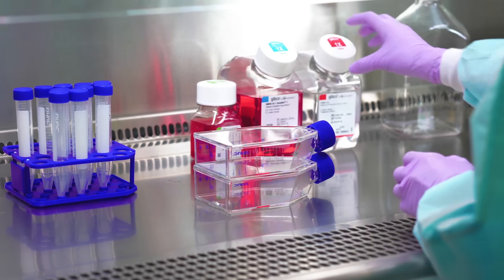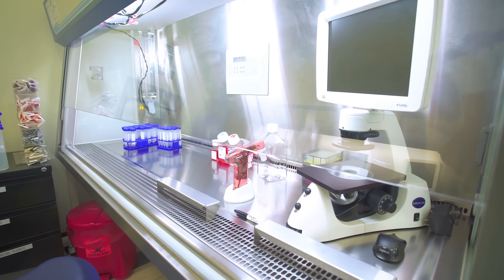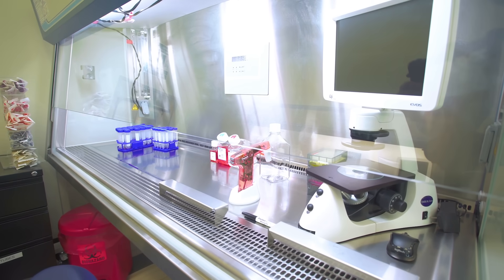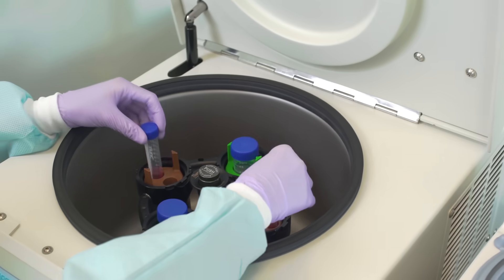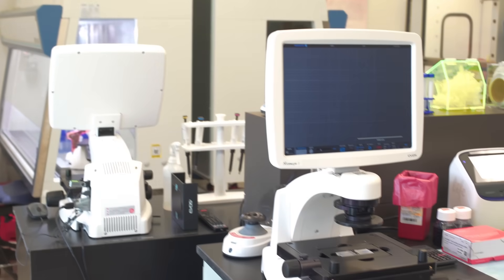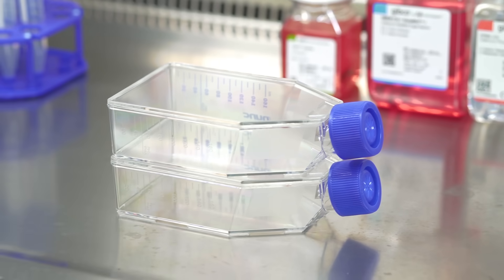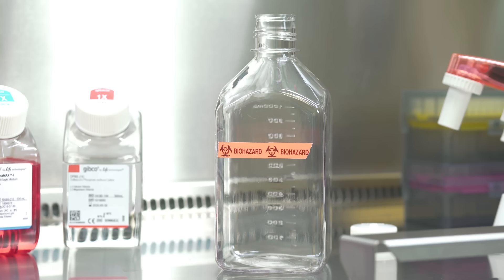Proper setup is important. Have everything you need close by. The basic equipment you'll find in a cell culture lab includes a cell culture hood, an incubator, a water bath, a centrifuge, a refrigerator-freezer, a hemocytometer, and a microscope. You'll also need cell culture flasks, medium and other reagents, pipettes, and waste containers.